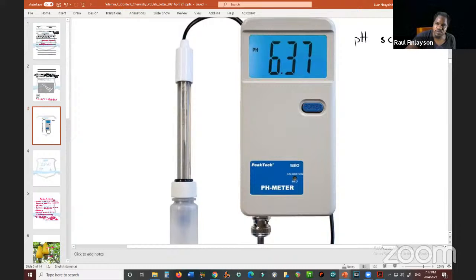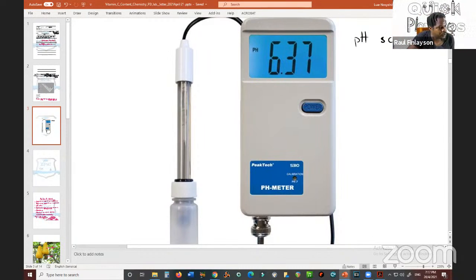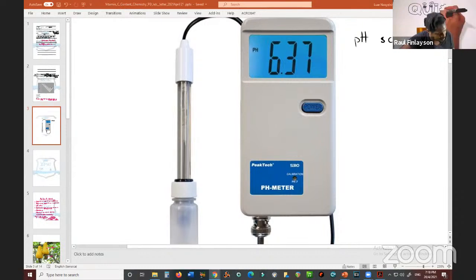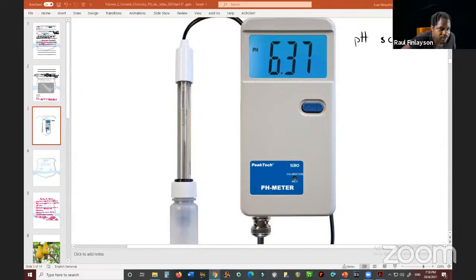But with the indicator, the color usually behaves differently. The indicator in an acid doesn't have any color, but in a base, the color changes to a bright red or something. So when you slowly add it, the color comes and goes, comes and goes, until you get a permanent color change. The only thing left for me to do to emphasize that is to show you a video of what that is. Because that will help you to understand here.